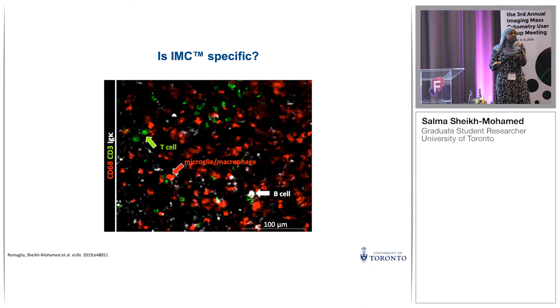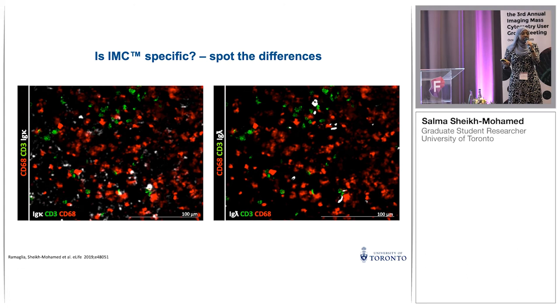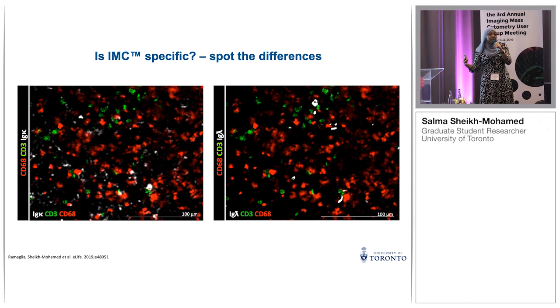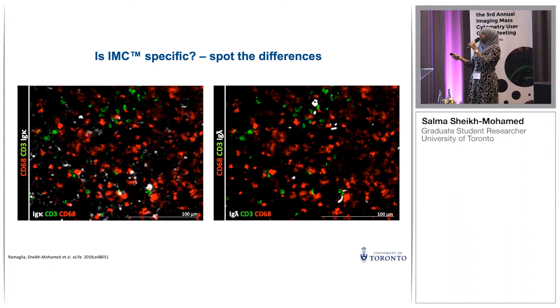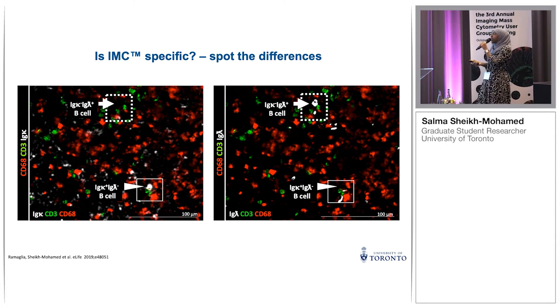The next question was whether our IMC signal is specific. Looking at B cells indicated by IG kappa, microglia or macrophages by CD68, and T cells by CD3 — we know from allelic exclusion that B cells will be either IG kappa positive or IG lambda positive, and shouldn't be double positive. When we turn on just the IG kappa channel, no B cell appears in one square; switching to IG lambda, that B cell pops up. On the opposite end, the IG kappa B cell disappears when IG lambda is turned on. This tells us our staining is specific to the cell types we're interested in.